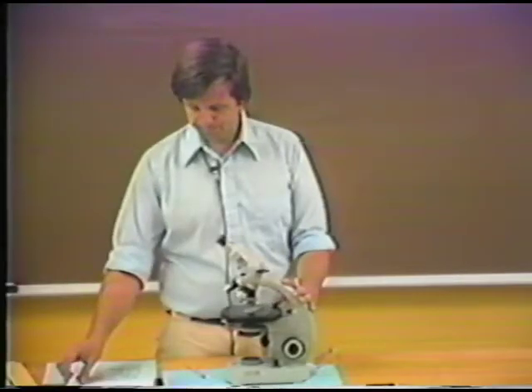So the number of color curves that you see in a particular interference figure is really measuring the retardation. And if the mount is the same size, then of course it tells you about the birefringence of the particular mineral. So these are uniaxial centered optic axis figures as shown on mounts that show increasing kinds of retardation.